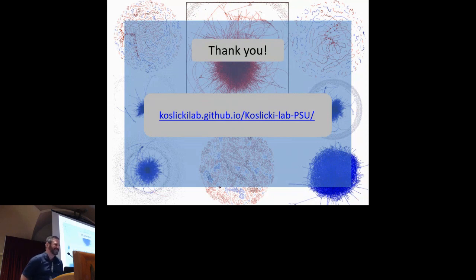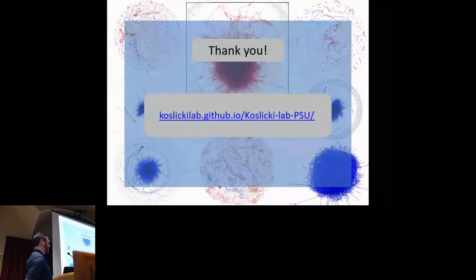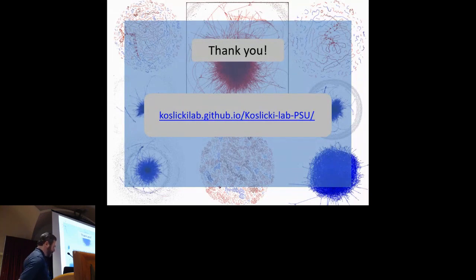I welcome all questions. I think there's one from online from Mihai. Does TAMPA handle non-canonical taxonomic ranks? The space between genus and strain is quite more complex than the genus, species, strain subdivision implies, and this complexity is highly relevant to some analysis. Yeah, great question. So support for other taxonomic ranks and taxonomies, yes.